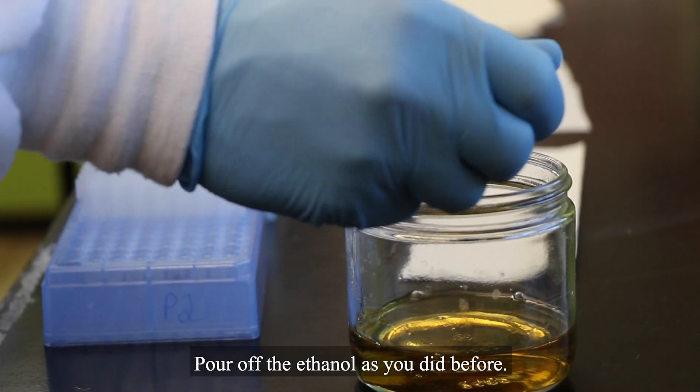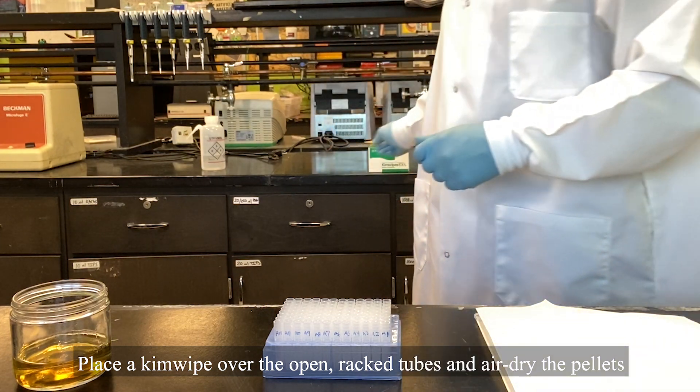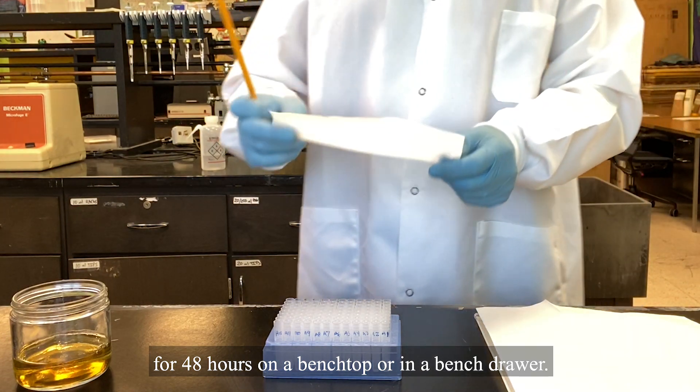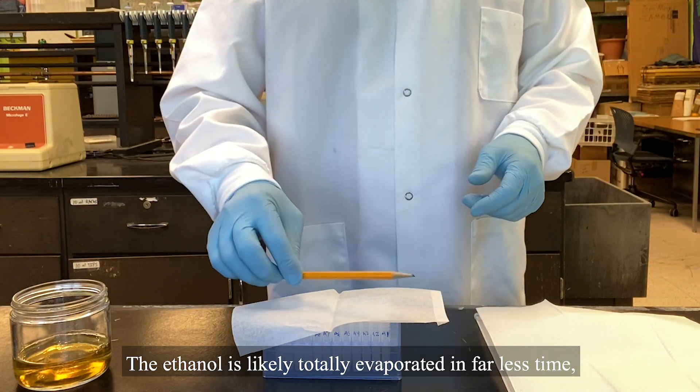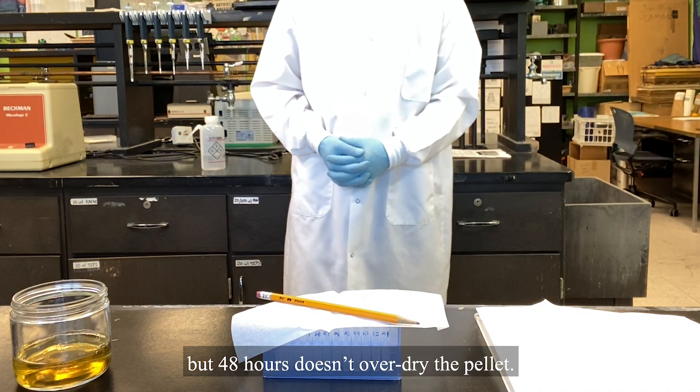Pour off the ethanol as you did before. Place a chem wipe over the open racked tubes and air dry the pellets for 48 hours on a bench top or in a bench drawer. The ethanol is likely totally evaporated in far less time, but 48 hours doesn't overdry the pellet.